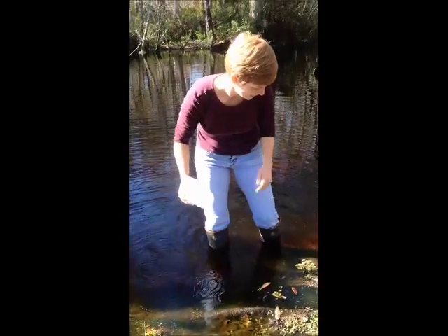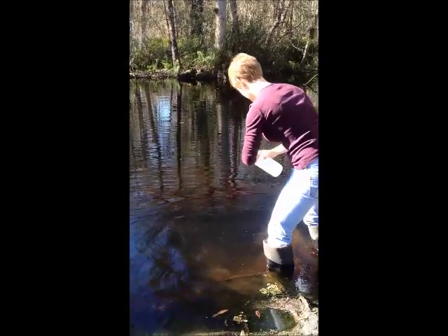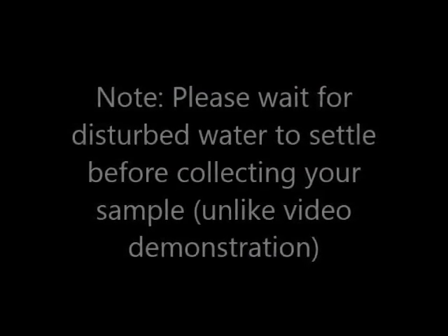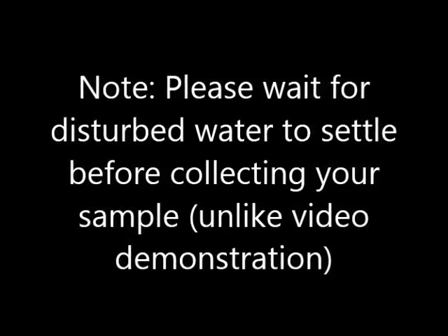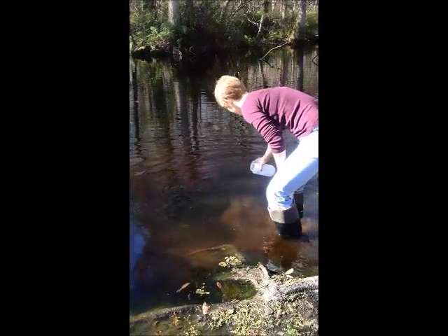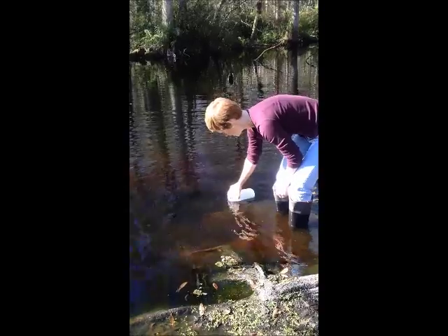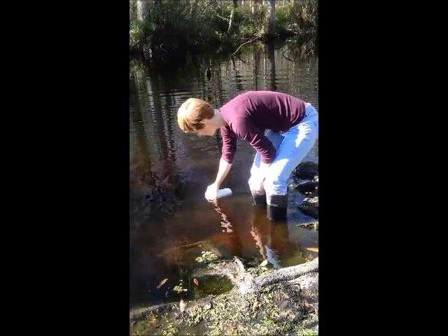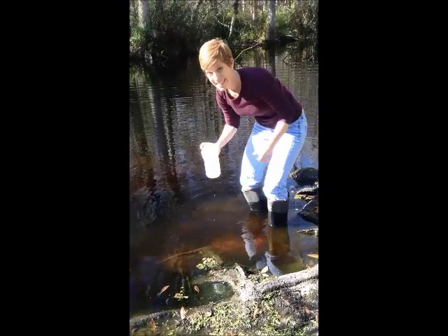Put the cap on your container as you move further upstream, away from the water that you just disturbed. Then hold your container parallel to the water, filling it up by collecting water right at the surface. You will need to tilt your container up to get a full 1 liter sample. Screw the lid on immediately.